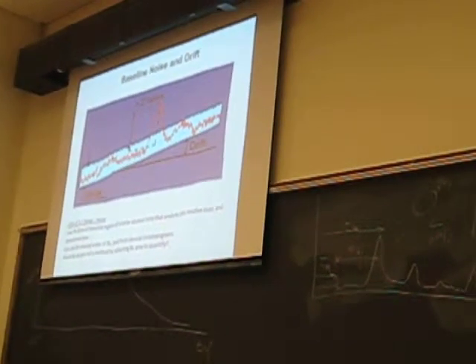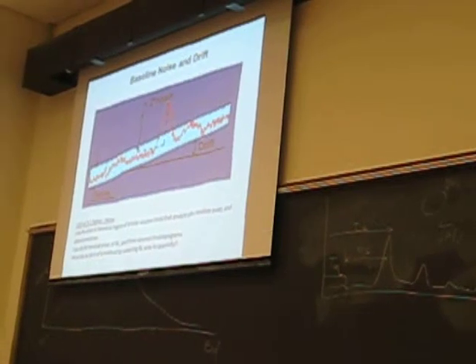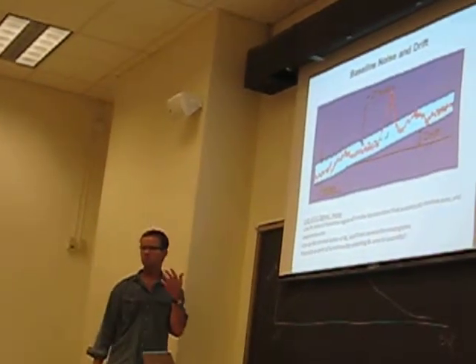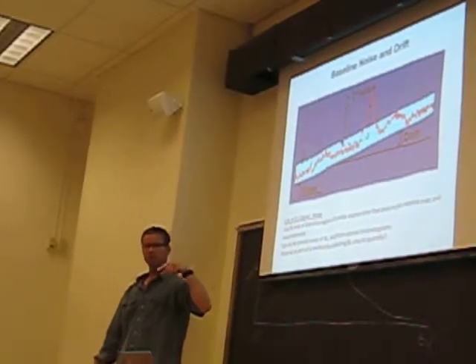So for your experiment right now, your lab right now, you're faced with two options. You've already faced this. One is, I'm going to analyze some blanks a bunch of times, at 20 minutes or 15 minutes each, to try to determine what my detection limit is, based on how reproducible those blanks are.